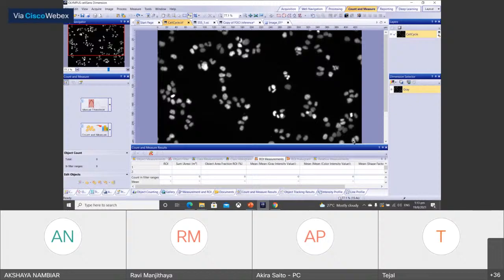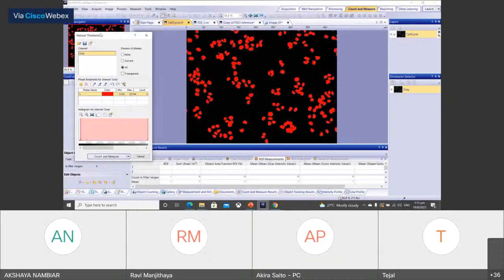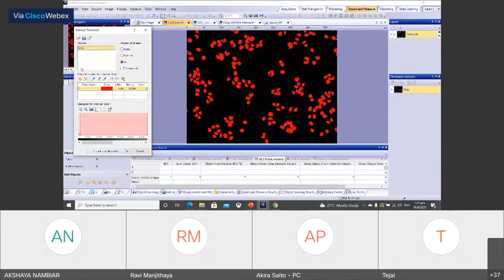So maybe you can see this image. This is just a simple stained nuclear image. As I mentioned, the easiest thresholding is to use the intensity information, and you can see that it is detected very well. And of course, you can change the threshold level yourself by changing the line of this threshold.